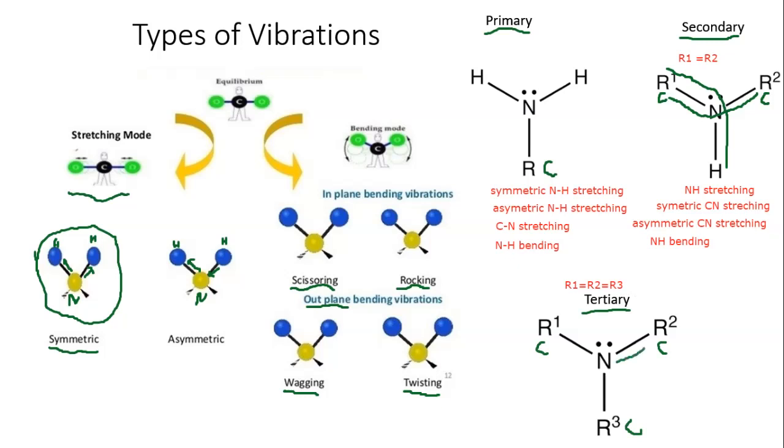So we can have symmetric stretching. They all stretched out at the same time. So mainly what we're having is symmetric CN stretching.